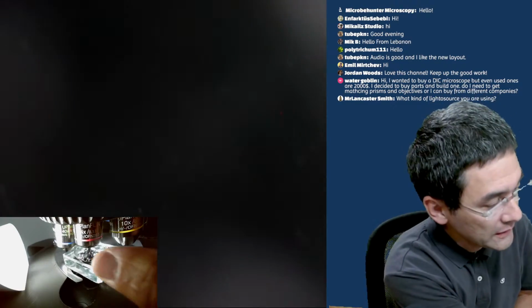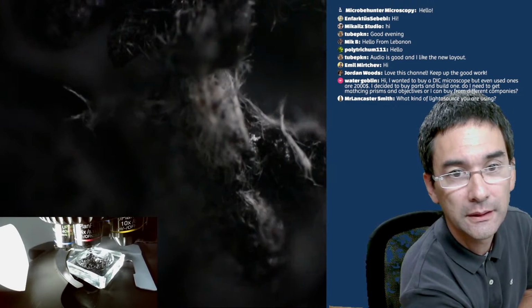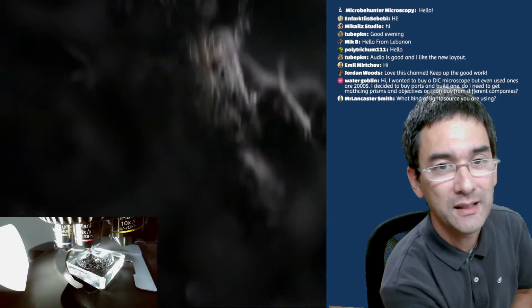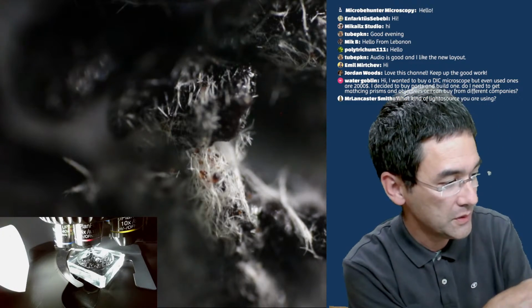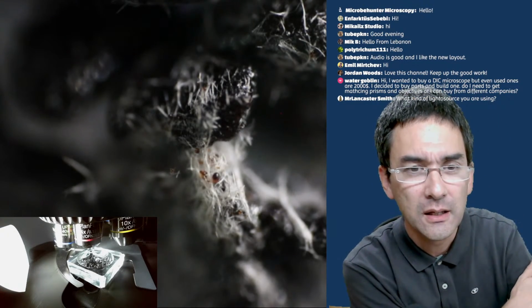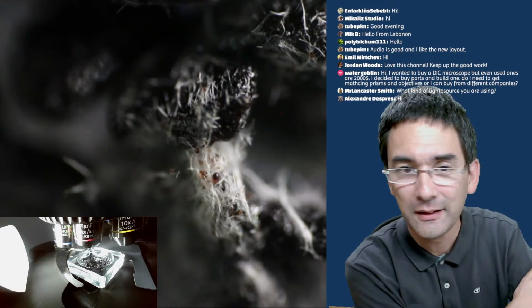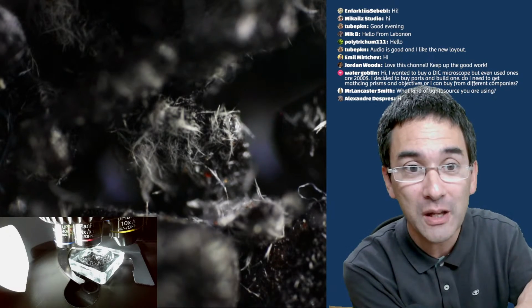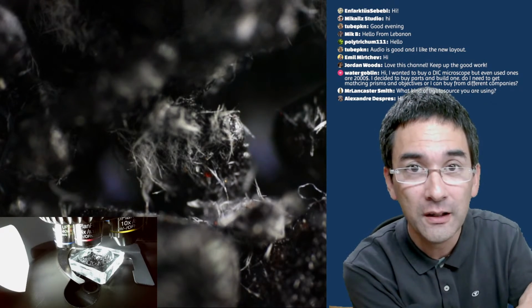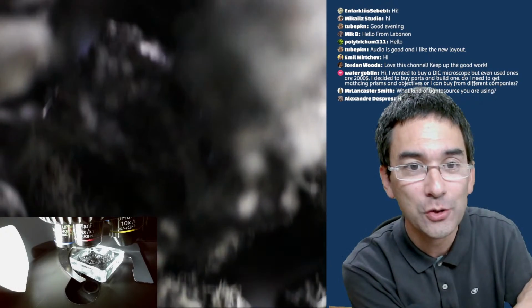It is now a little bit dark, so I'm going to put it down like this, and you see it's very dark. Maybe I have to increase the light a little bit. My flashlight has two intensities, and look at this. These are the grains of the instant coffee, and there is this weird white stuff on here. When I saw it the first time, I thought that my coffee got moldy. But I'm going to tell you right now, this is not mold. And I could not believe this myself.